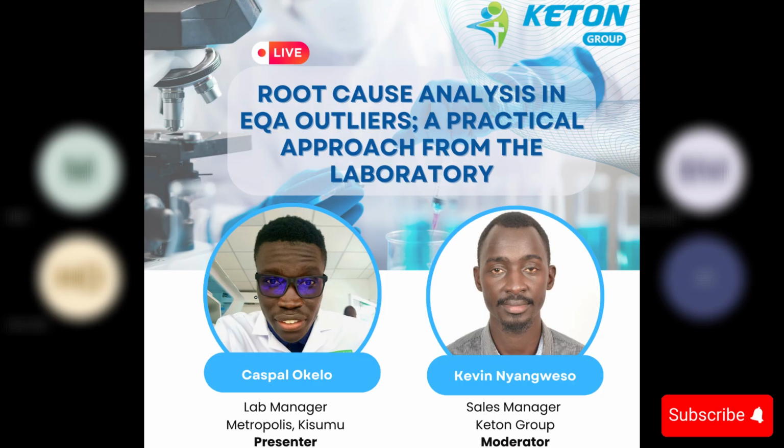But it varies from lab to lab, and it requires a discussion with the lab quality management team to understand what is best for the patient. But best practice is to use the reference mean until you have a statistically significant population to have a calculated mean. Thank you.